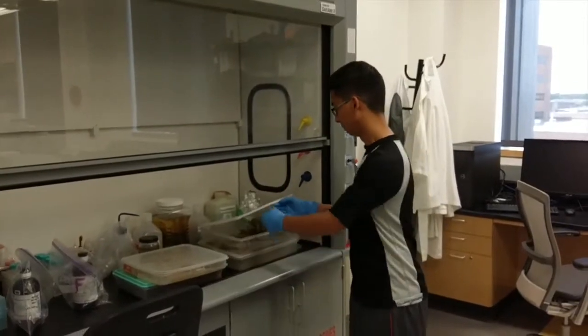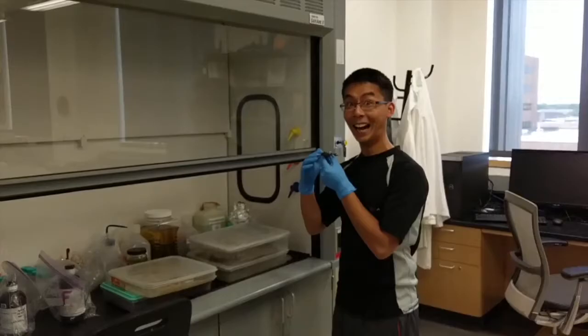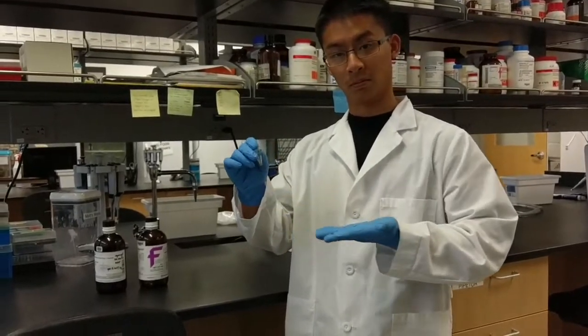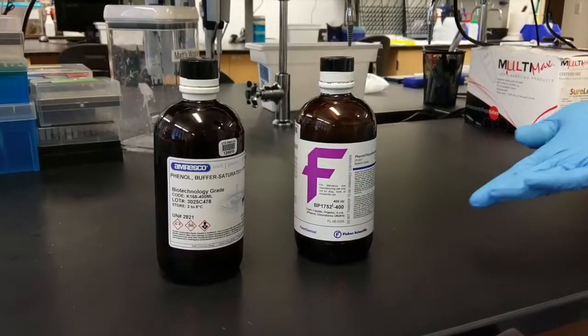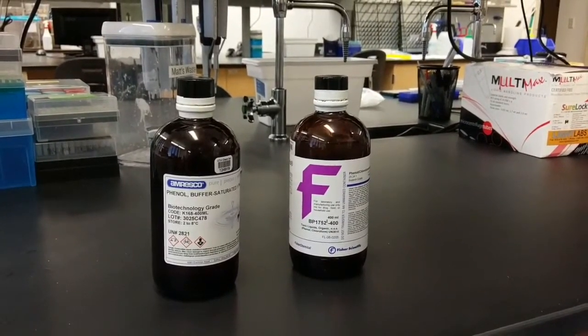First, we start out with an organism. Now that we have our tissue from our organism, we need to precipitate out the DNA. We do that with phenol and chloroform. This will precipitate out our DNA so we can start doing downstream analyses.